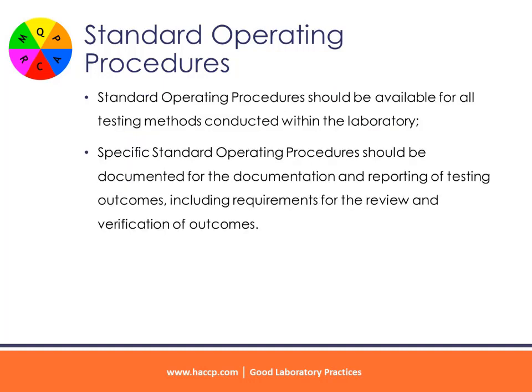Standard operating procedures should be available for all testing methods conducted within the laboratory. Specific standard operating procedures should be documented for the documentation and reporting of testing outcomes, including requirements for the review and verification of outcomes.